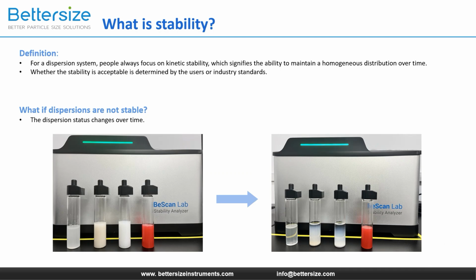Dispersions like suspension and emulsion are thermodynamically unstable systems because small suspension particles or emulsion droplets tend to decrease the large specific surface area and surface energy. In manufacturing, in order to increase the kinetic stability of the product, various precautionary measures are taken, including the addition of stabilizing agents, adjustment of pH value, particle size control, and homogenization. Therefore, it is possible that a dispersion is thermodynamically unstable, but kinetically stable.